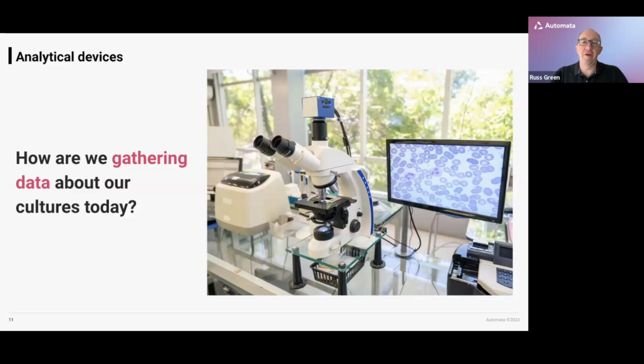So the other area I want to touch on is analytical devices, and this is a particular favorite of mine because this all ties back to labware at some point. We have to think about how we're gathering data about our tissue cultures, our cells today. If we're in a lab which has no automation and no very automation friendly devices right now, this is probably quite a familiar scenario where we have a slide-based microscope that we've had to do some manual preparation for, and then we're gathering data through the human operator and making decisions based on that data. So this is something that clearly might need to change as we move into an automated environment. And I'll come back to this a little bit later on.